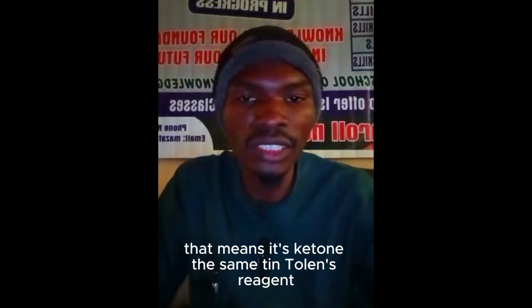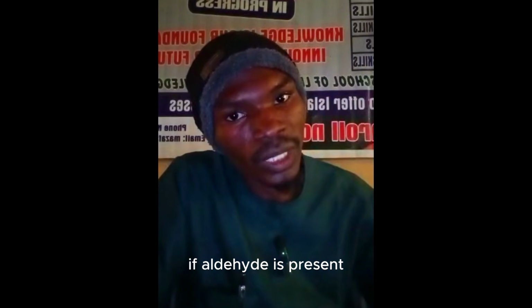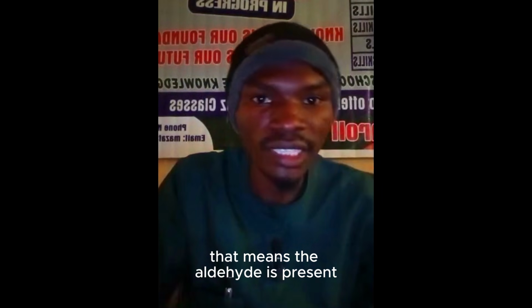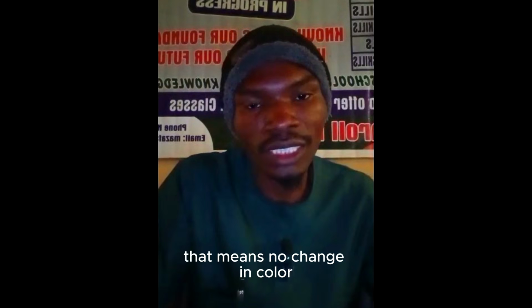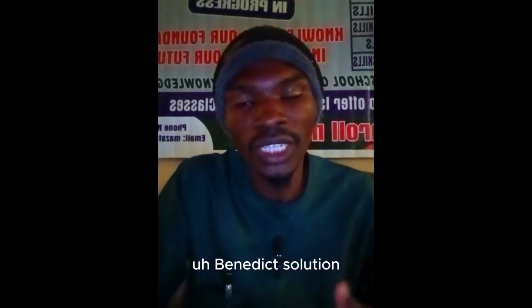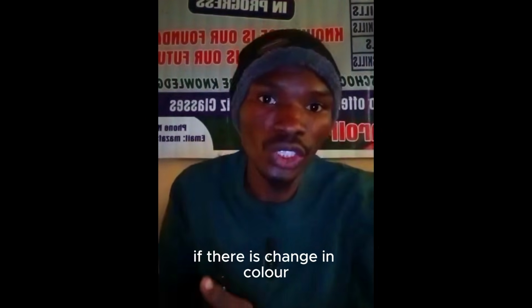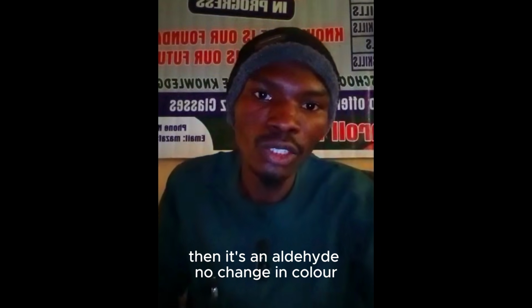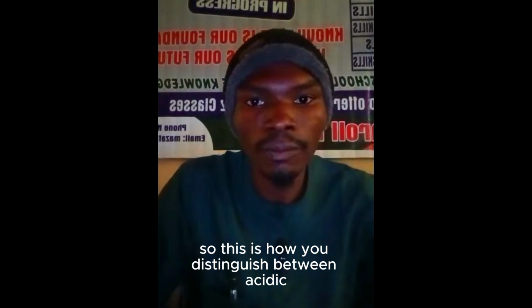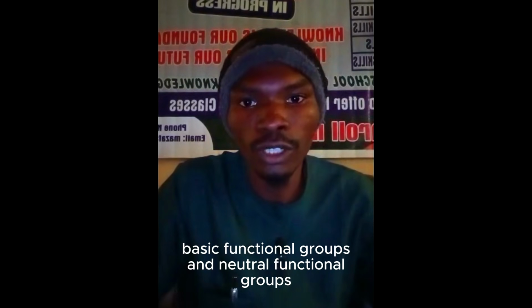The same thing with Tollens' reagent. Tollens' reagent gives a silver mirror, so it's called the silver mirror test. If an aldehyde is present, it will give you a silver mirror, which means a positive test. But if it gives a negative test, that means no change, then it is a ketone. The same thing with Benedict's solution. If there is a change in color, then it's an aldehyde. No change in color, then it's a ketone. So this is how you distinguish between acidic functional groups, basic functional groups, and neutral functional groups.